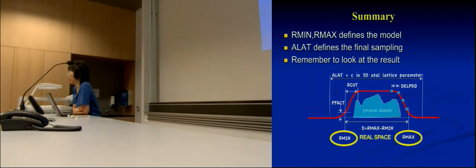Once you have two points in there, it starts to have an estimate of error. As you know, if you average two values together, you have a sigma value that doesn't mean a lot. You have 3 points, 4 points, 5 points, and the more you have, the more meaningful the sigma value that you get.